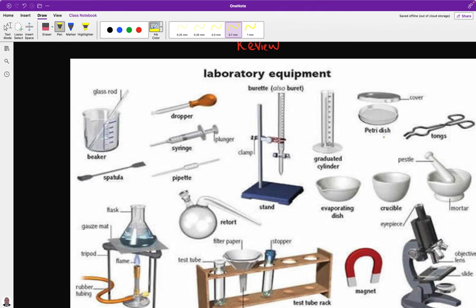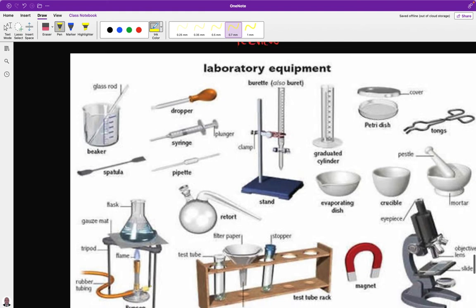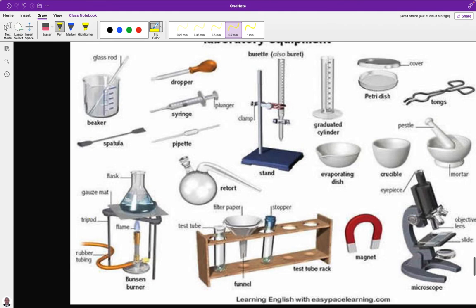We have a petri dish. We have a stock (boss head) used for holding glassware like beakers. We have a tripod and gauze — these are used when we want to heat a solution using a Bunsen burner. We place the gauze on the tripod, place the flask containing the solution on it, and the Bunsen burner generates the energy required for heating.